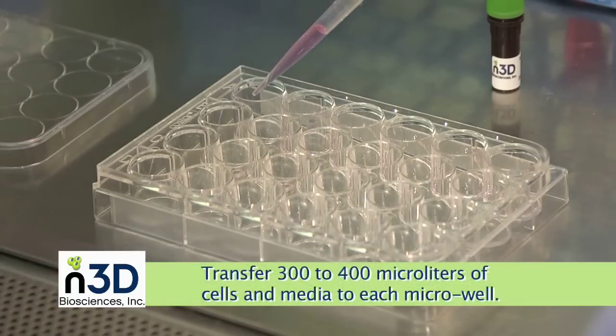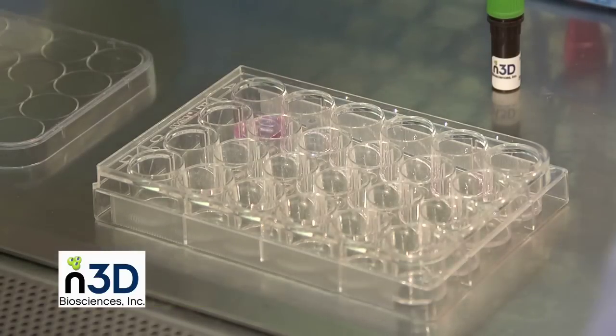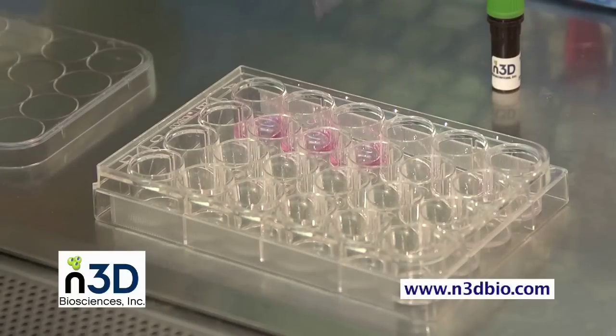Transfer 300 to 400 microliters of cells and media to each microwell. Depending on the cell properties and experiment, between 1,000 and 100,000 cells per well is optimum. We encourage you to experiment within this range to find your ideal cell number, such as performing a serial dilution of cells.